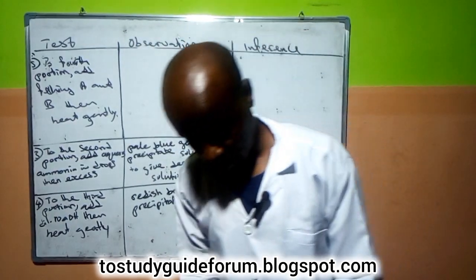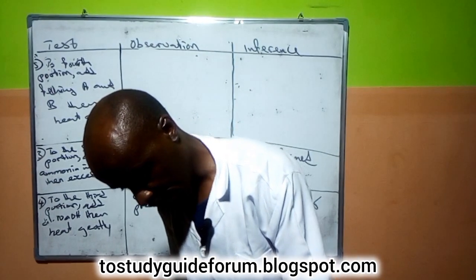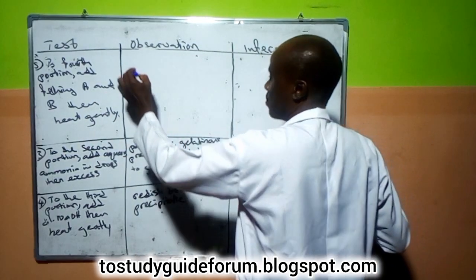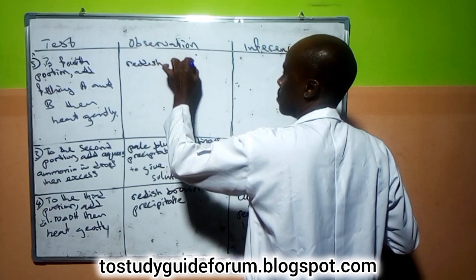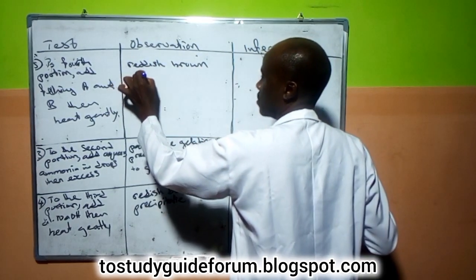What it simply means is that we have a confirmation that what we have here is a reddish brown precipitate.